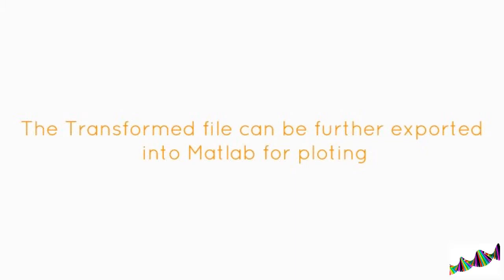The transform file can be further exported into MATLAB for plotting.